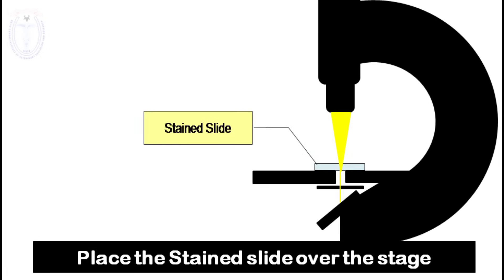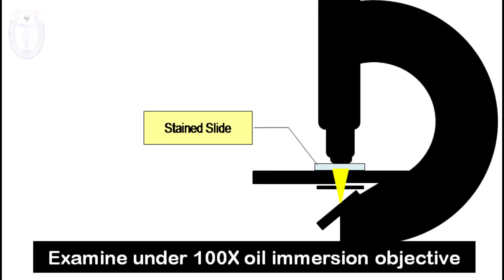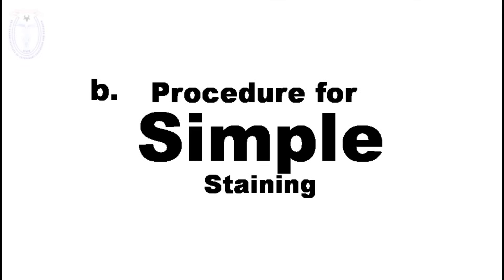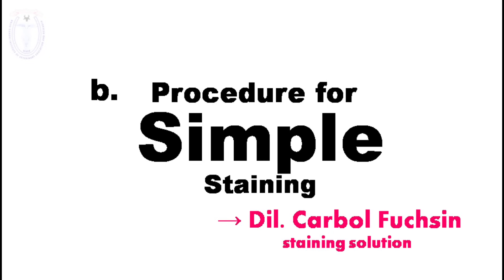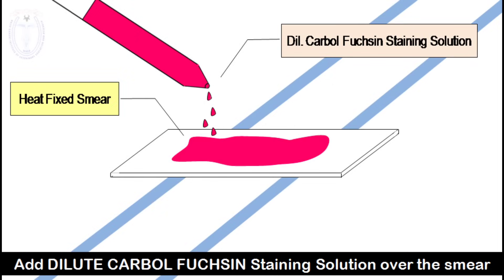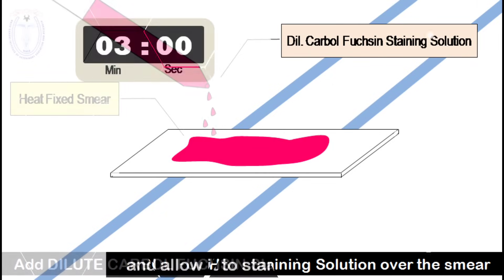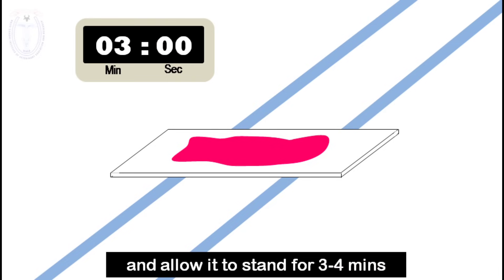Place the stained slide over the stage and examine the slide under 100x oil immersion objective microscopy. The procedure for simple staining can also be done using dilute carbol fuchsin staining solution. The only change is to add dilute carbol fuchsin staining solution over the fixed smear and allow it to stand for three to four minutes.